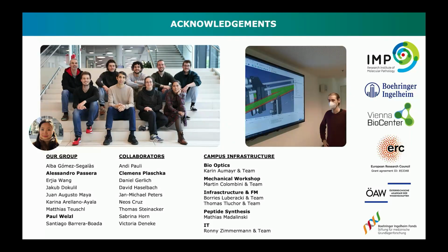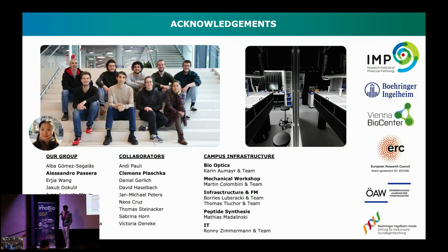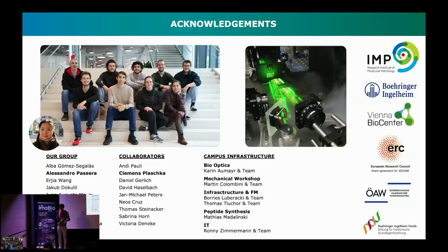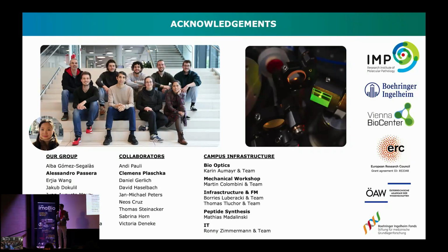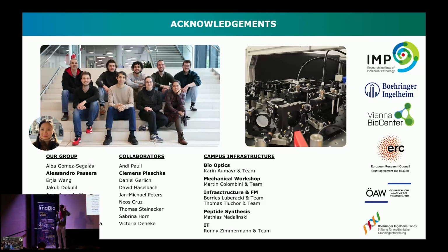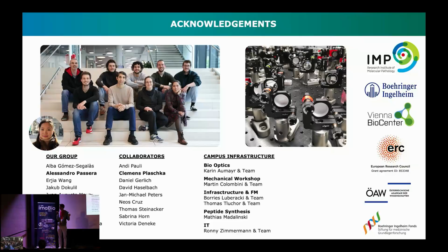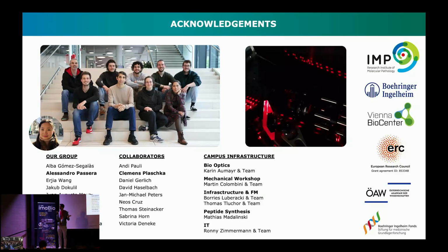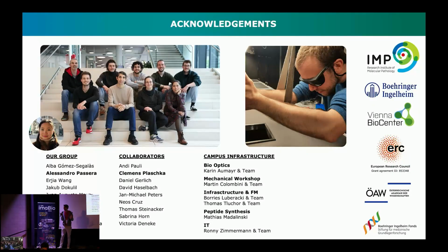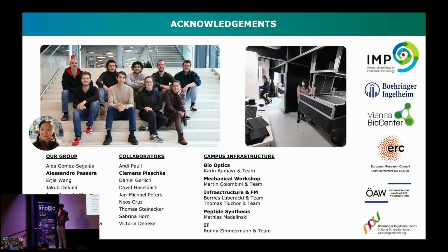So DNA-PAINT is not the fastest in the neighborhood. MINFLUX, not either. So you can imagine the combination of them goes slower because you're looking at a single confocal spot at a time. So if we do wide field DNA-PAINT, let's go in order. RNA FISH protocols are overnight. If we do proteins on top, sometimes it's a day and a half. So the protocol is a bit long, but it's okay. To be honest, it takes longer to design the probes than to do the protocol.